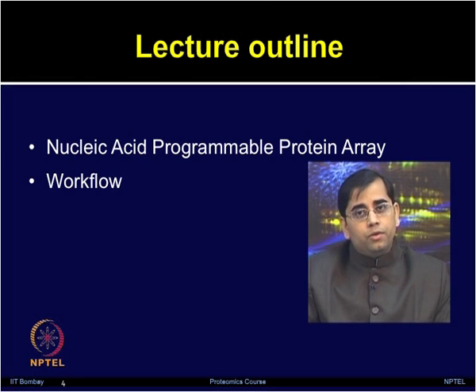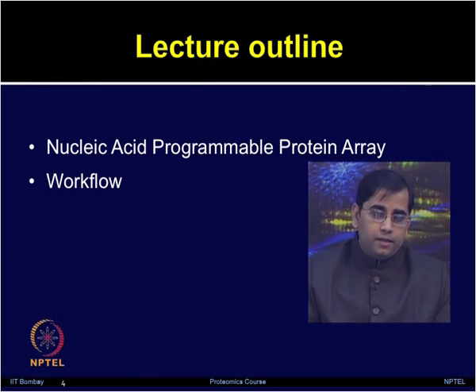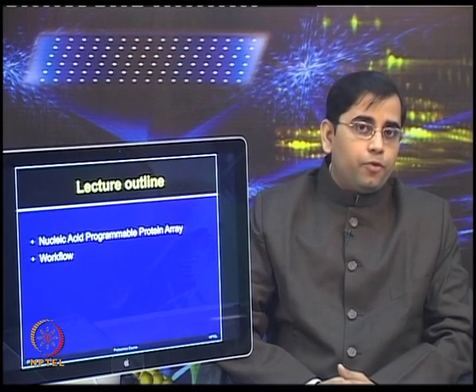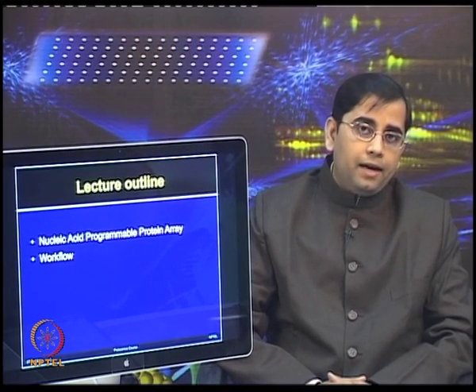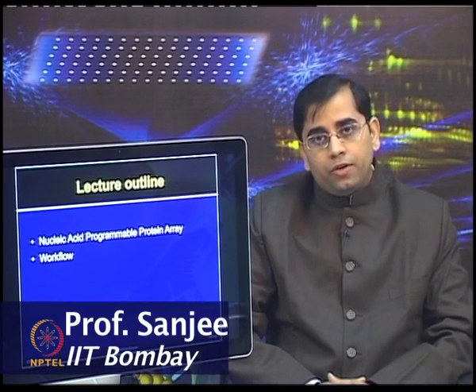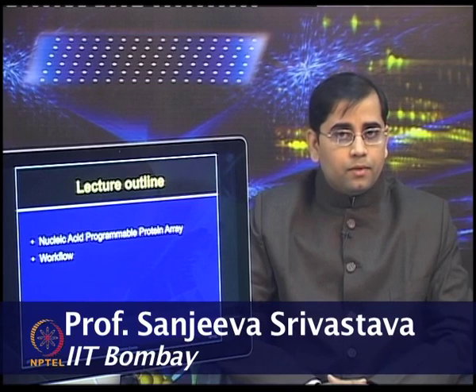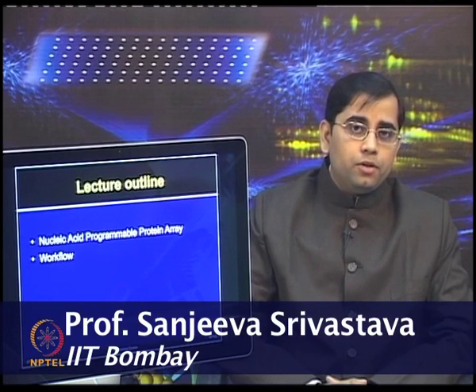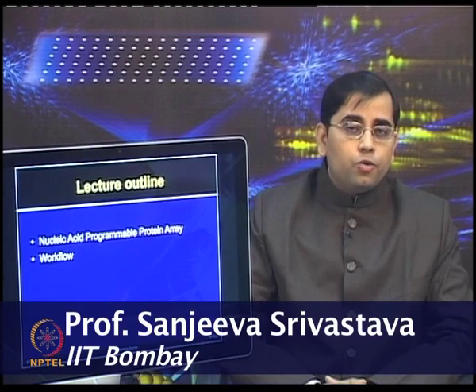I will walk you through the workflow step by step, and how various parameters one needs to monitor. I will talk to you about each step, for example, cloning and plasmid preparation, aminosilane coating of the glass slides, and what type of printing parameters one needs to ensure for good printing quality.